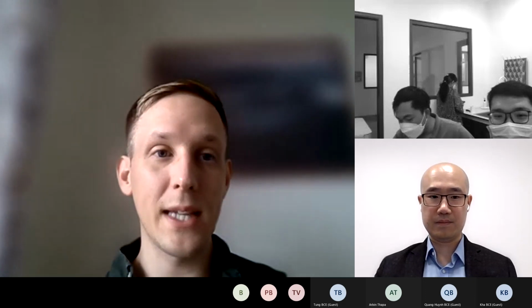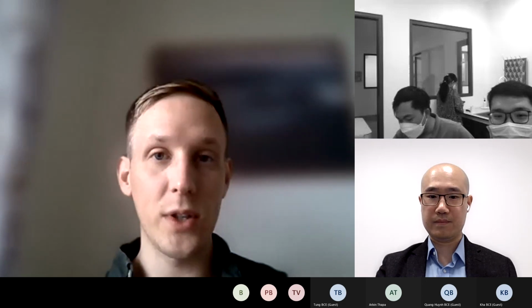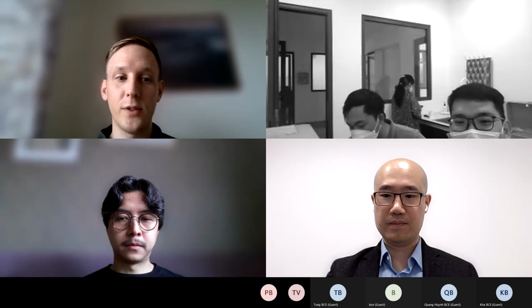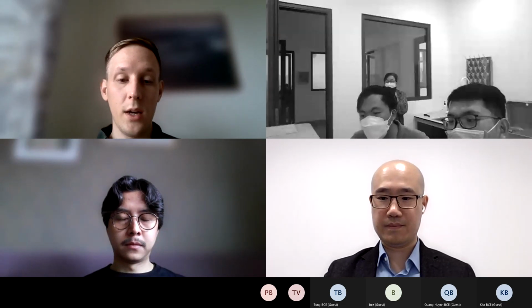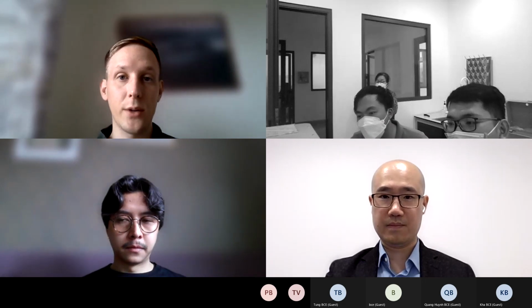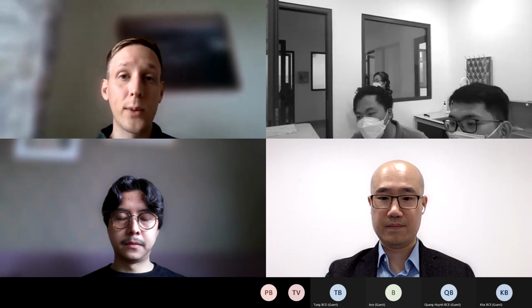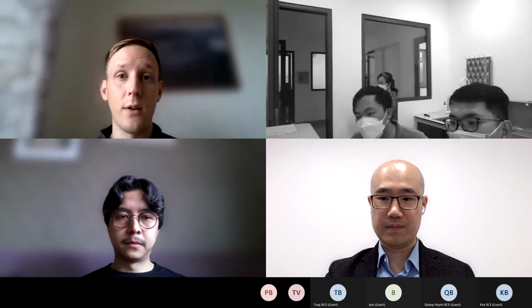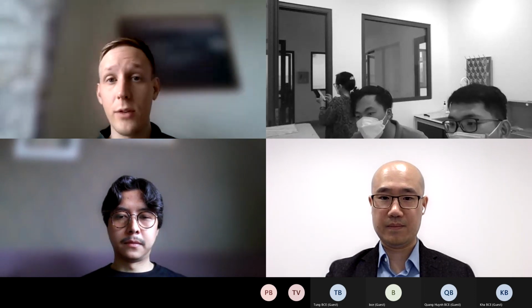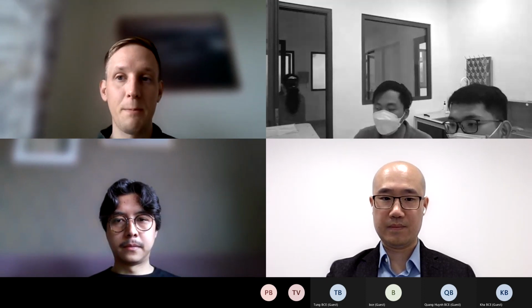So then that was it for today, because I think 2 hours is enough for this first day, and then we're going to continue on Monday. So Arvin is going to go through the data that you shared with us and then provide you with the information related to that. And then we will continue with the software training on Monday morning. And then when everything is completed, you will get the recordings so that you have them.